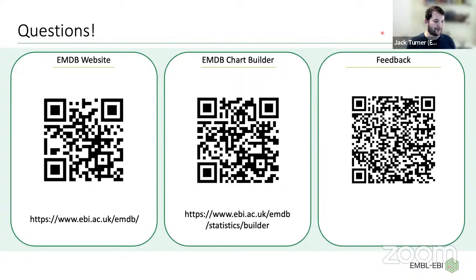Out of interest, is there any particular methodology that you've noticed there's not quite enough information for? That would be useful to feed back. Yeah, because this is a cryo-ET workshop, and I was trying to learn cryo-ET reconstructions, tomogram reconstruction.